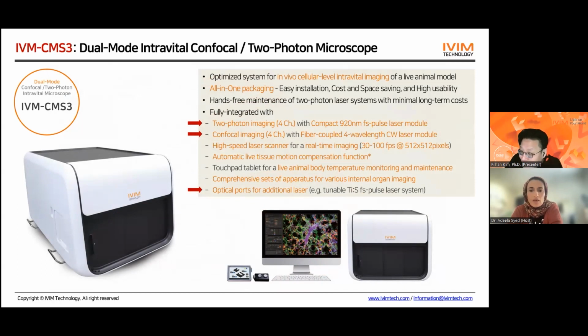Any other questions? One more: what is the type of file formats? Any common image format we use. Of course we use our own file system, but you can export it to TIFF or JPG or AVI videos or MPG videos. So we have an export protocol.